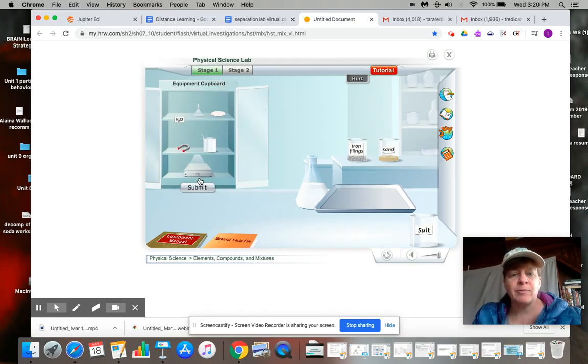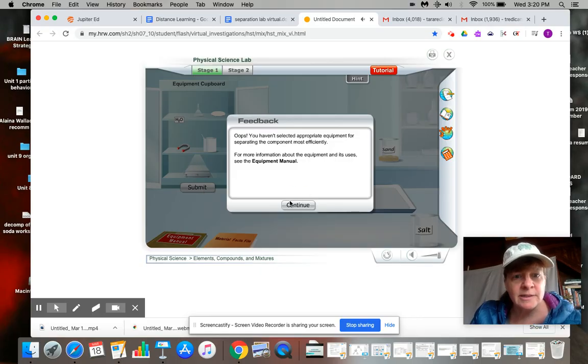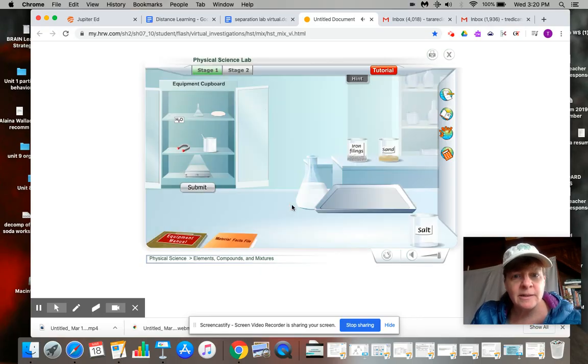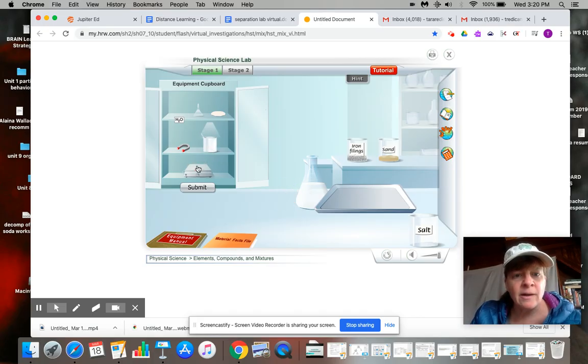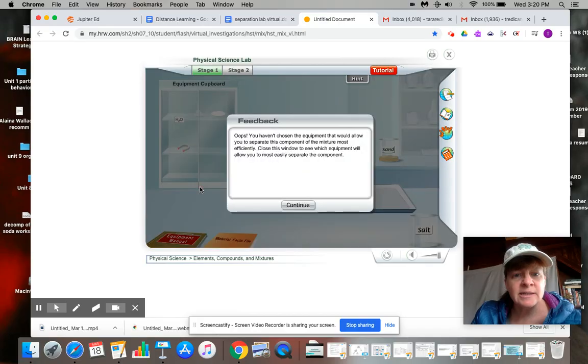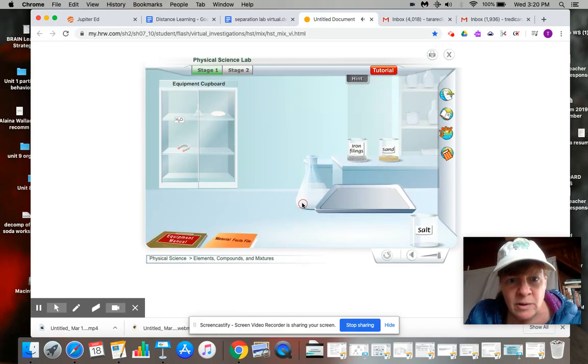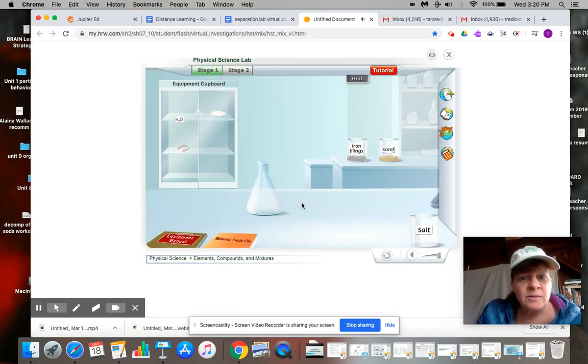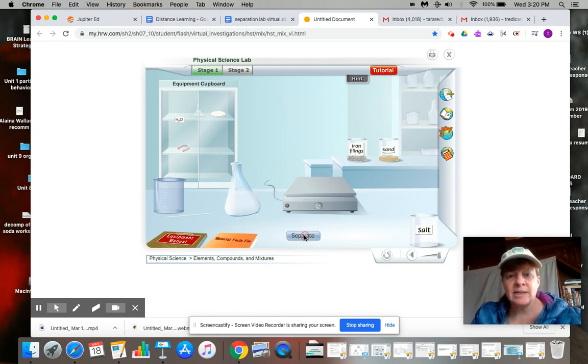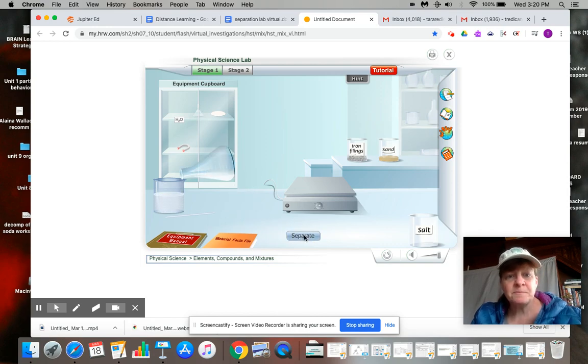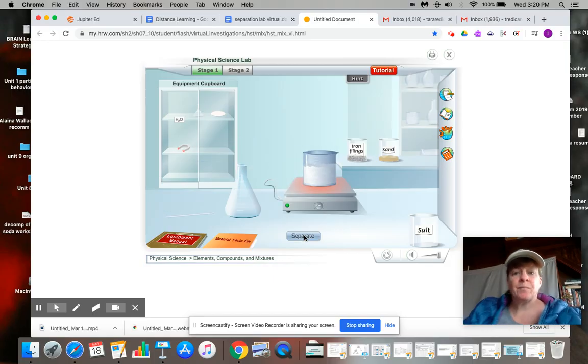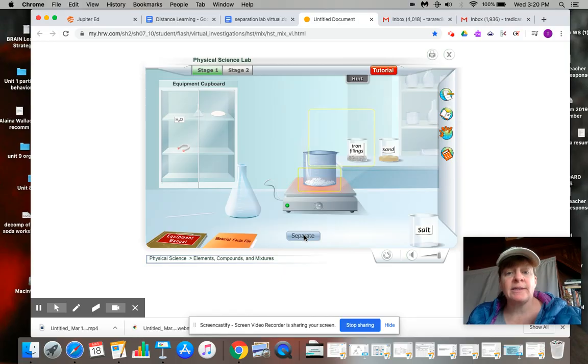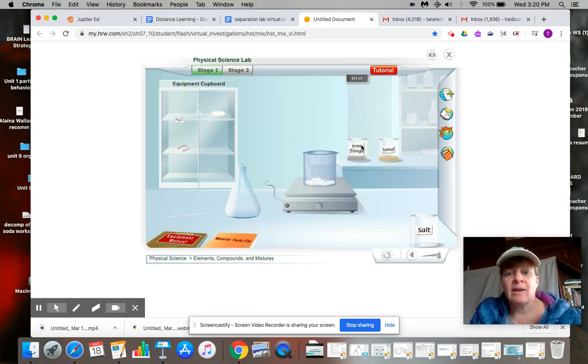So we're going to use the hot plate here. Let's see what else I need. And I don't know if they're going to put it back in there or not. Let's see. Yes, there we go. It's going to go on the hot plate into the beaker. And now the water is going to evaporate and it's going to leave the salt behind. So now we actually have separated all three substances.